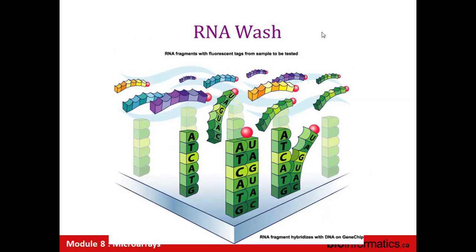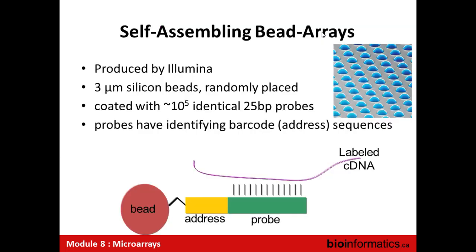Okay. So we went back to molecular biology for a long time. Don't worry, we're going to go to pure bioinformatics in a couple of seconds. So the last type of array we'll talk about super briefly are Illumina arrays, Illumina bead arrays. It's a very different technology.